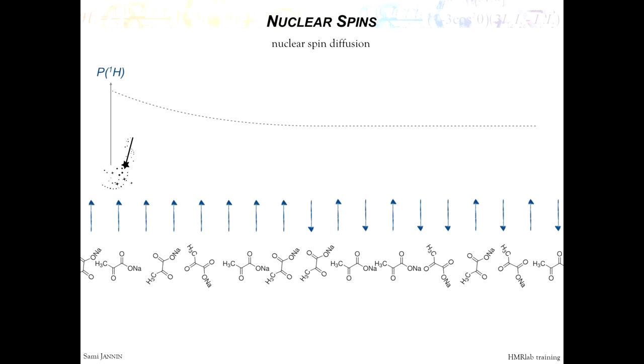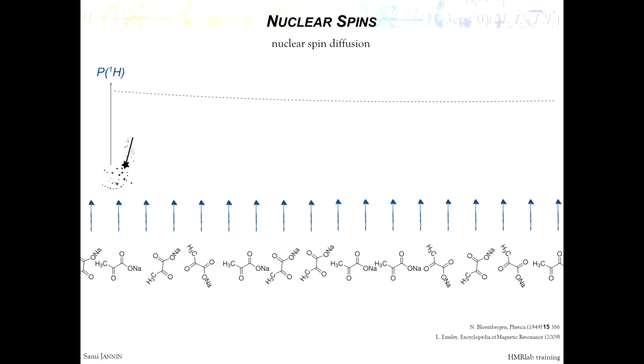Okay, so this spin is going to depolarize this one, and then it's going to spread again. And so after a while, if you have efficient spin diffusion and you manage to polarize one spin on the edge, it should polarize the whole line, given that relaxation is not too fast. Okay. So what are the time scales for that?